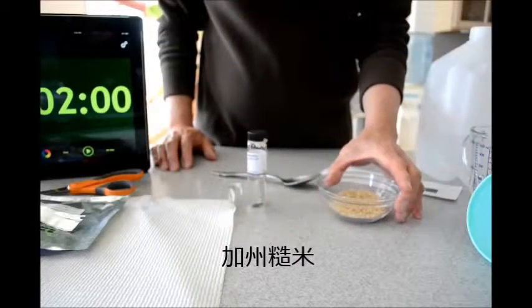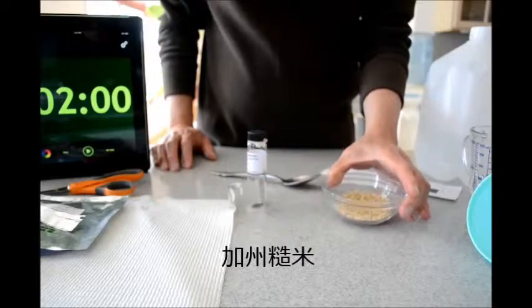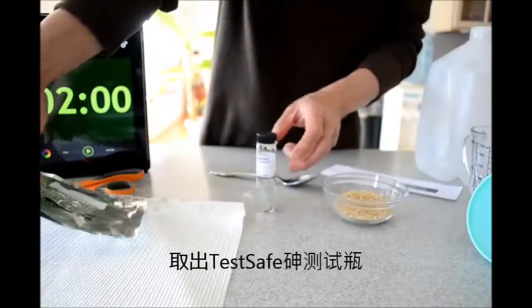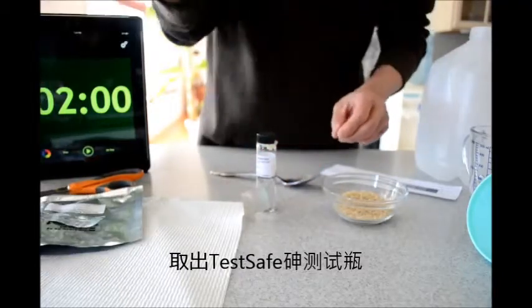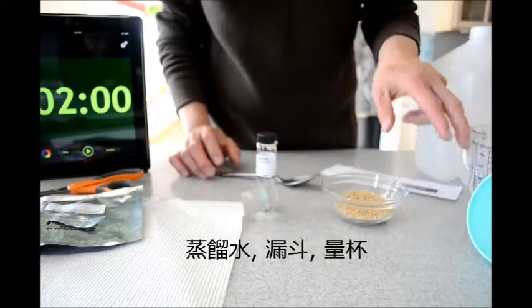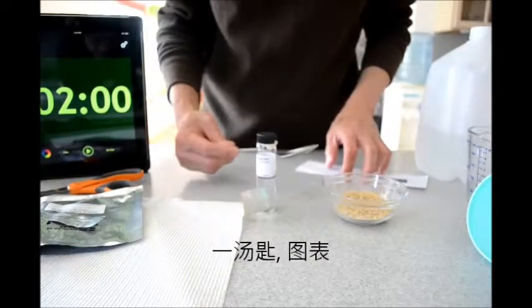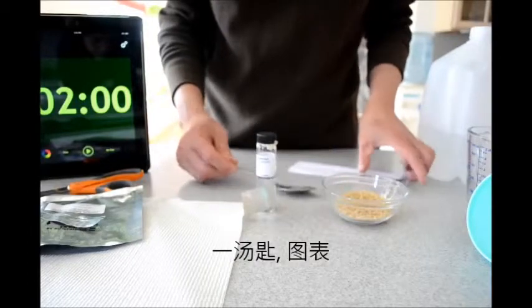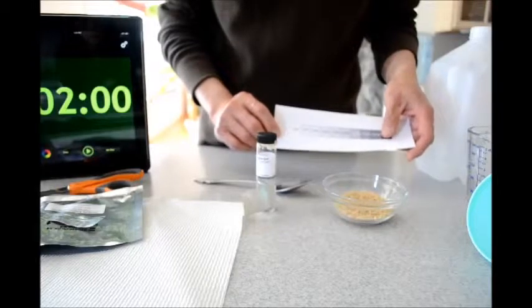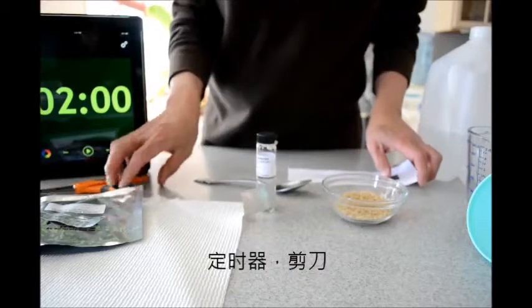Now let's see if brown rice has more arsenic than white rice. Here I have the brown rice sample, the test safe detector taken from the pouch that comes with it, and you'll need some distilled water or very clean water, a funnel, a beaker, a tablespoon for measurement, the chart so we can see if the result has arsenic or not, a timer, and scissors would be helpful.